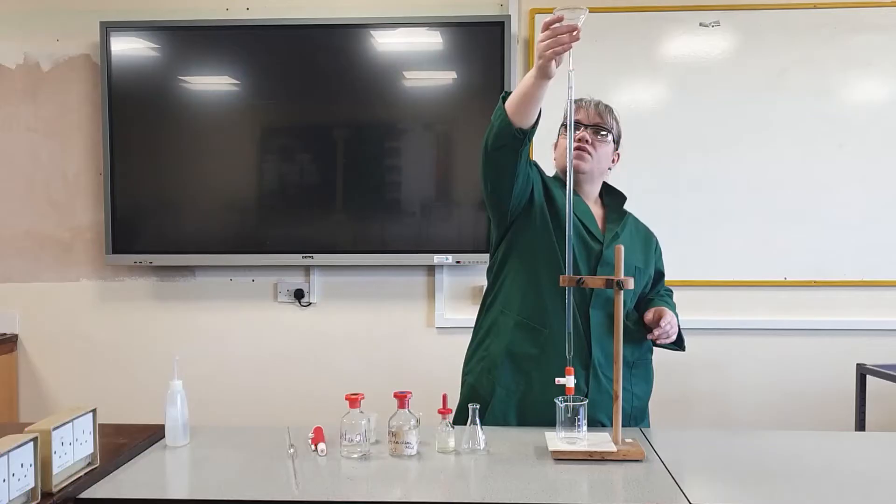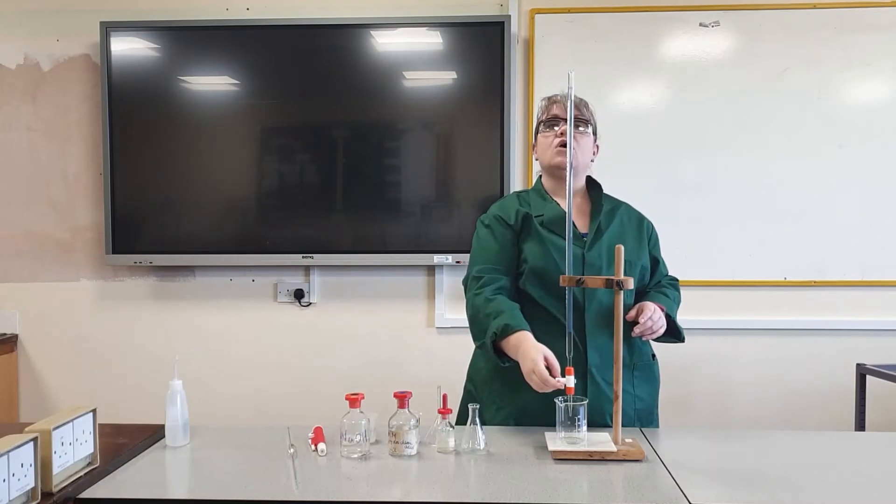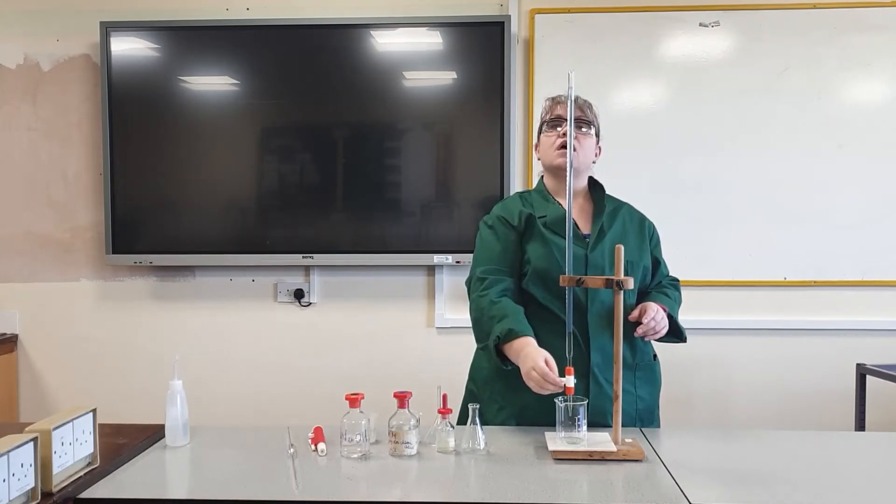Remove the funnel. Then slowly let the acid out until the meniscus is sitting on that zero mark. And then I'm ready to start.